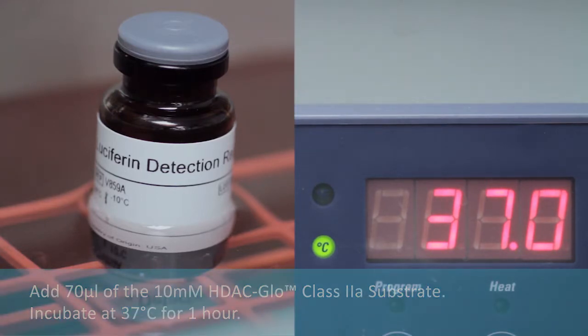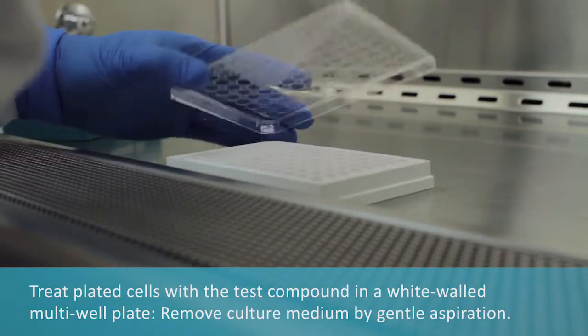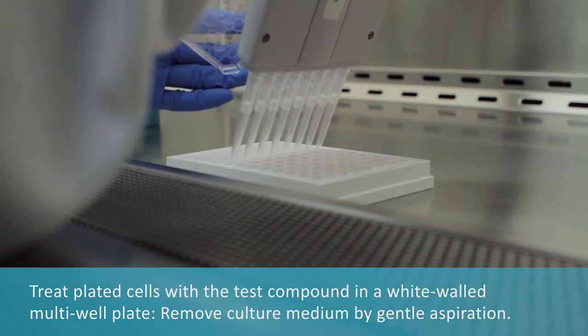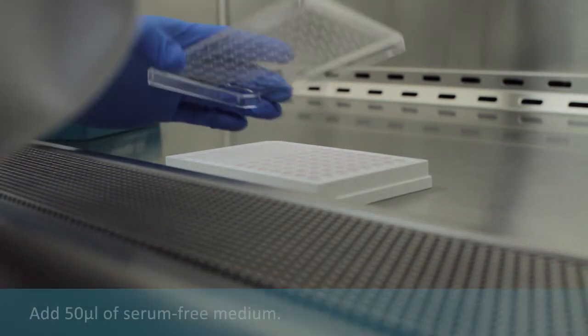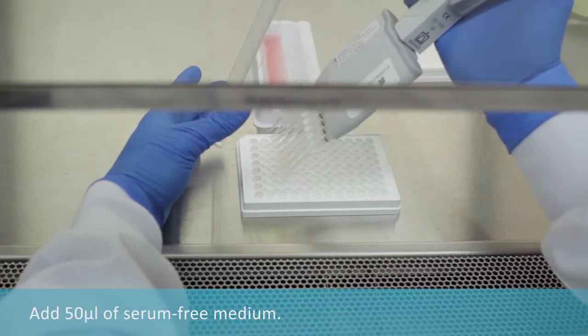While the reagent incubates, treat plated cells with test compound as follows. Remove culture medium by gentle aspiration. Add serum free medium.